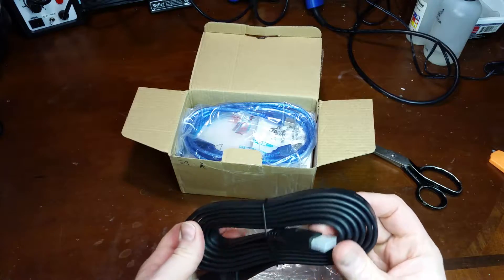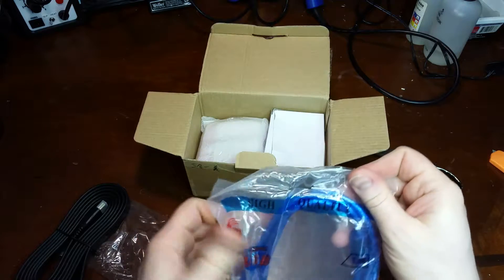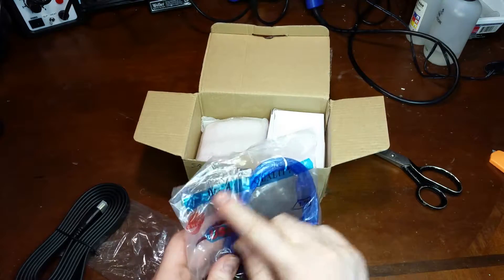Here is an HDMI cable, and this is going to be the USB cable. It says high quality.